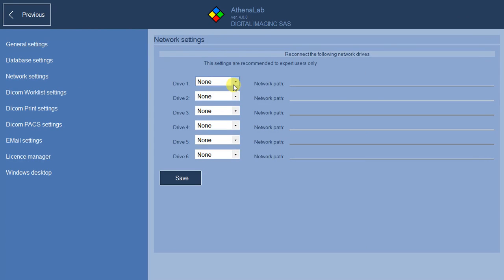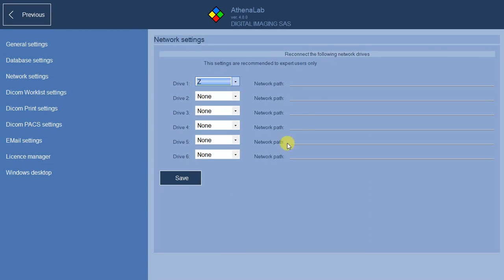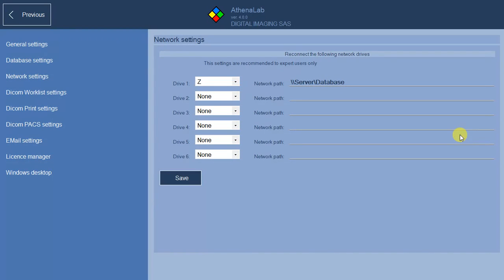In this window you can assign a letter to each drive you want to add. For example, if disk Z refers to the database folder of the server computer, the configuration will be: Drive 1, Z, double slash server slash database. The drives configured in this list are reconnected every time the program starts.